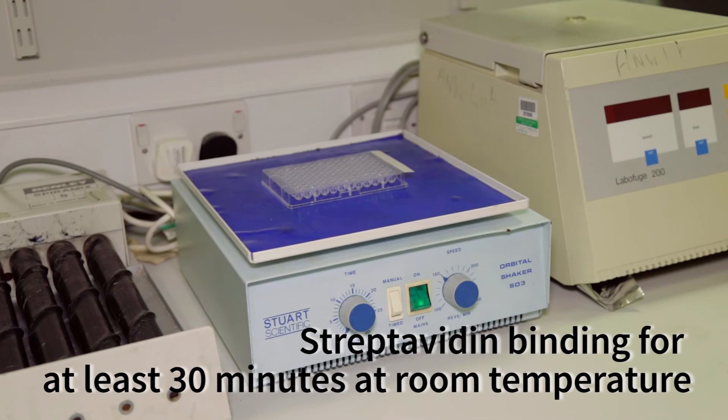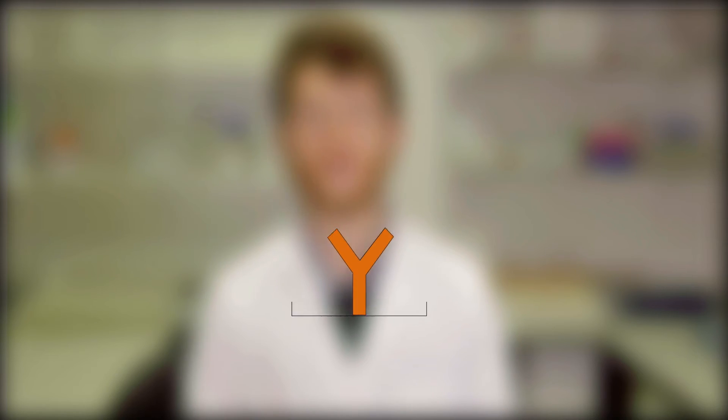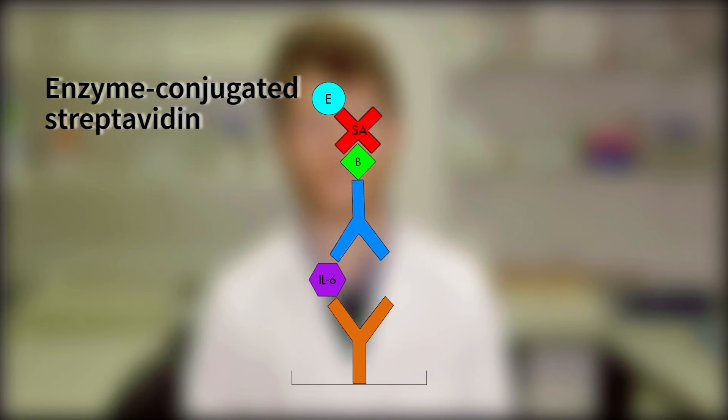As I mentioned previously, one end of our detection antibody is linked or conjugated to a small molecule called biotin. Biotin, in turn, is able to bind at high speed and with very high strength to a protein called streptavidin. We add a solution of streptavidin bound or conjugated to another enzyme across each well of our plate and incubate for at least 30 minutes to allow it to bind. Let's recap what's happened in the well so far: bound across each well we have a capture antibody, which is bound to our antigen of interest, IL-6. Bound to another portion of our IL-6 we have our detection antibody, which is conjugated to biotin. Finally, bound to that biotin molecule, we have a further molecule of streptavidin, which is conjugated to an enzyme.